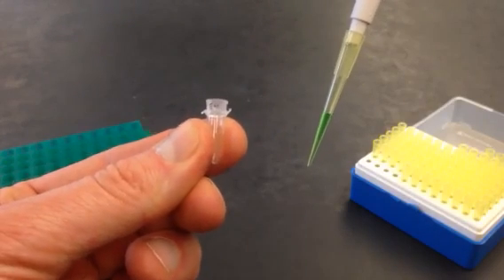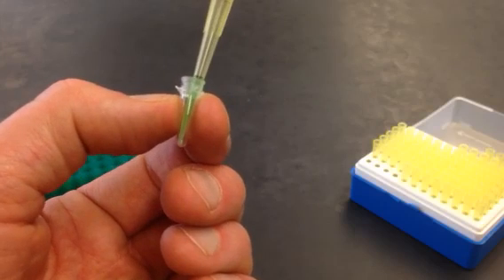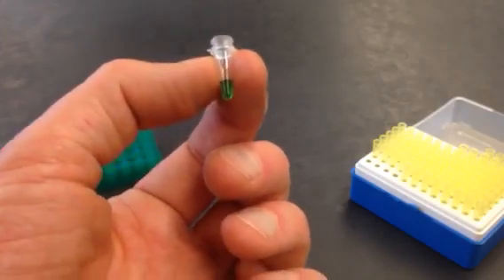Now it needs to go into this really tiny PCR tube that I've already labeled. Again, I'm not going to try and do this in a rack — I want to do this right up here where I can see it. I'm going to put the tip all the way in and gently push down to put that 40 microliters right where I want it.